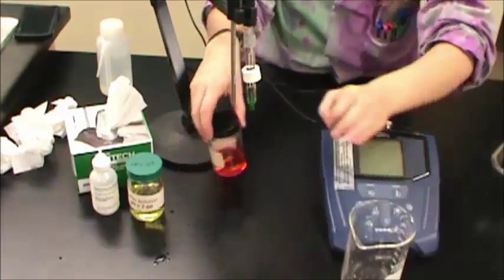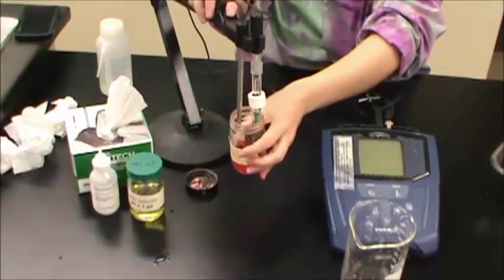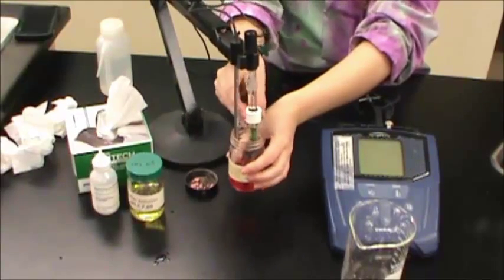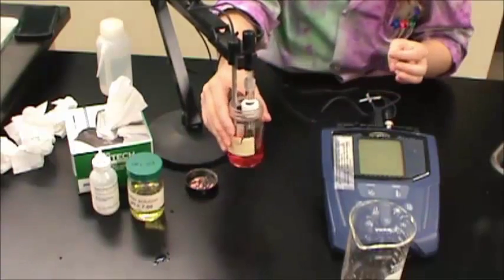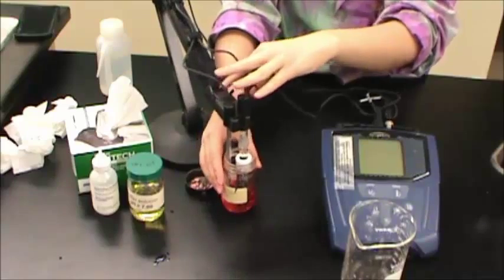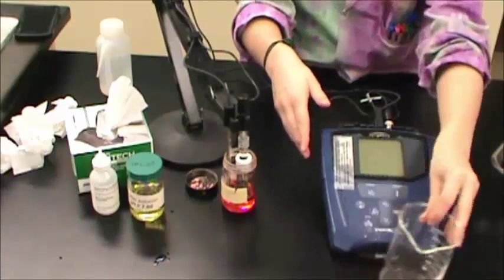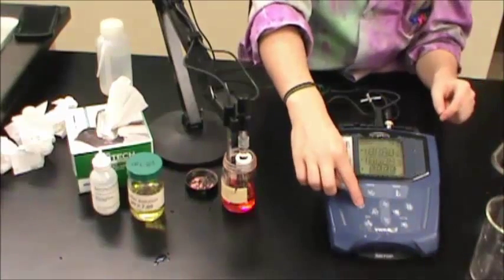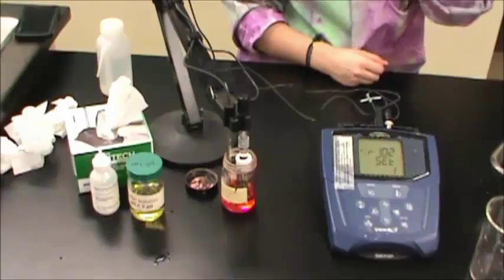Place both probes into either of the buffer solutions and swirl the container gently to remove any bubbles from around the ends of the electrodes. Turn the instrument on and leave the probes in the solution for approximately a minute before entering calibration mode.